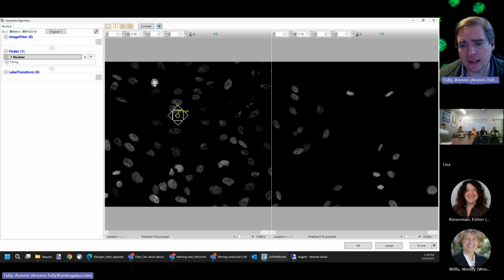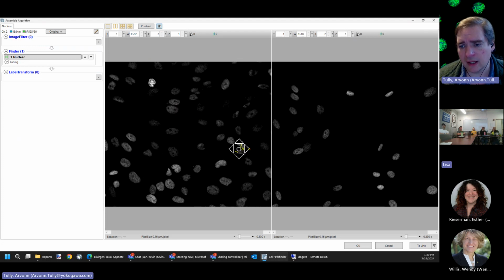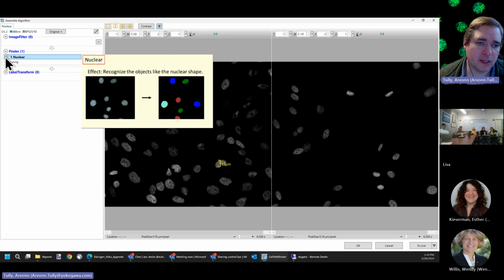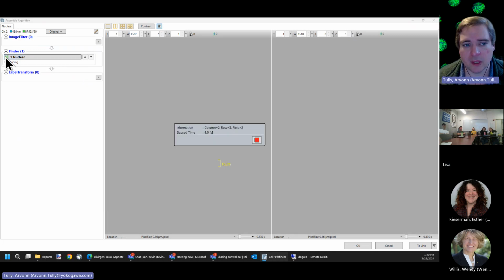Let's see here. So I'm not doing a good job with that measurement here. Let me fix that. So these are about 15 to 20 micrometers roughly. Again, a perfect measurement is not required for this particular setting, but you can go in, get a rough idea of about 15 micrometers.